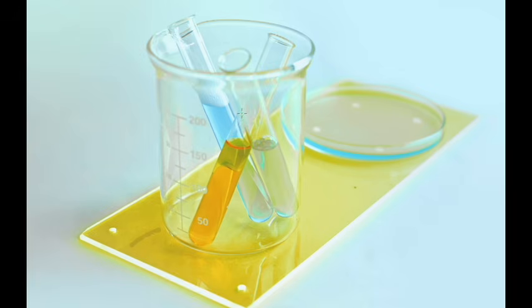And the other idea that we talked about is that you shouldn't put back in the same solution, because you risk contamination. So whatever utensil you're using, if you have excess, put it in some other solution. Don't put it back in the solution where you took it from. Okay, so you have these three.